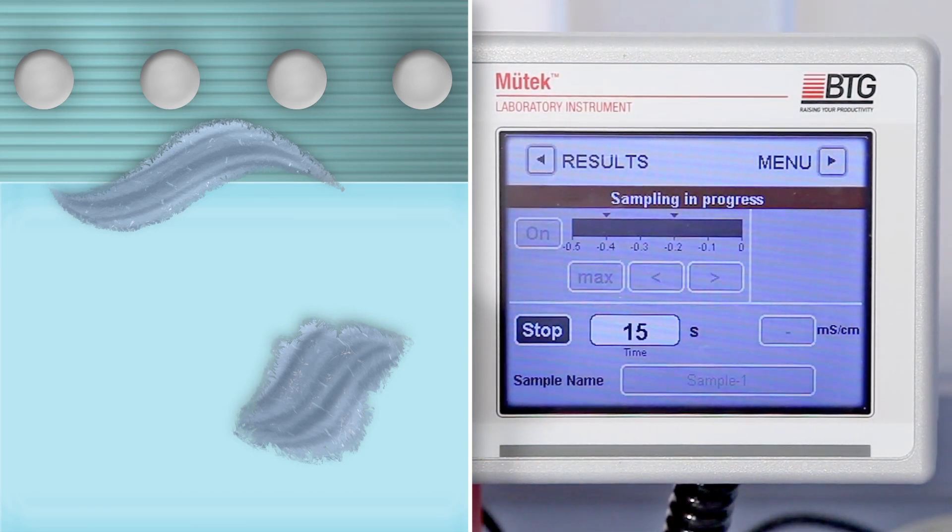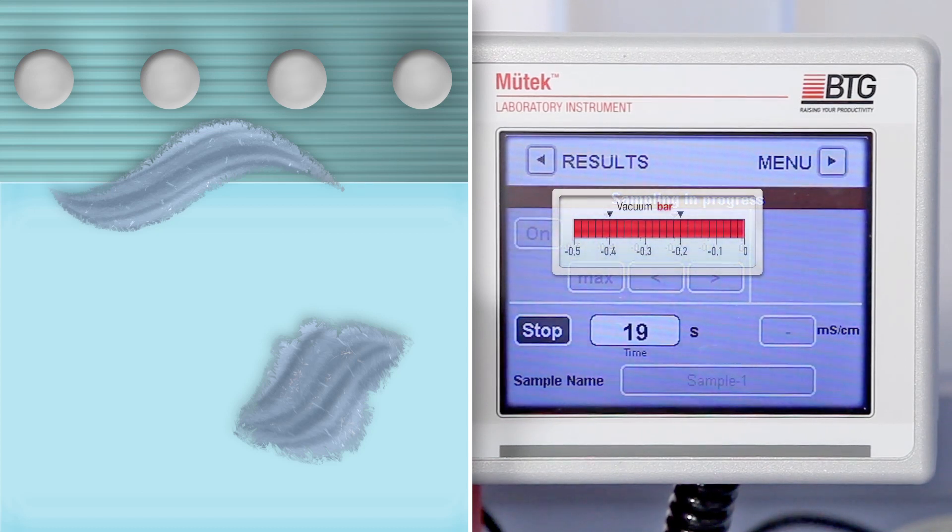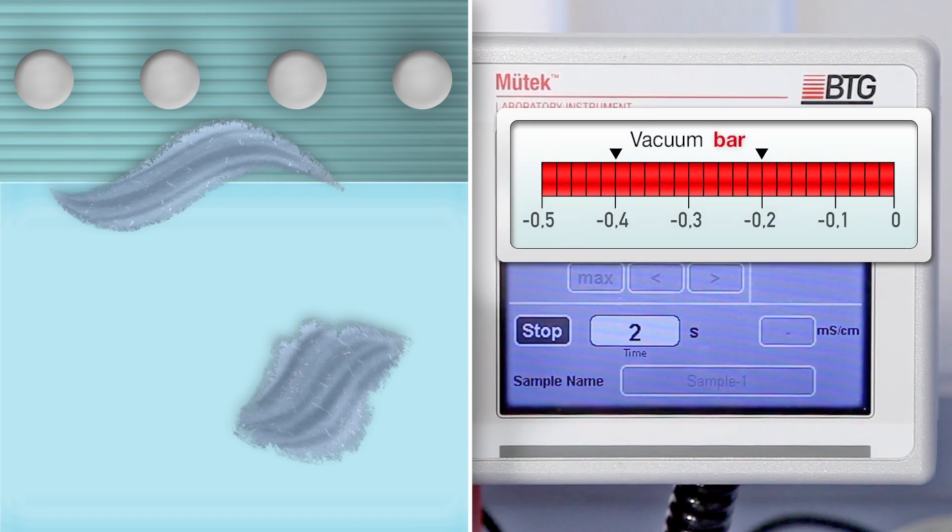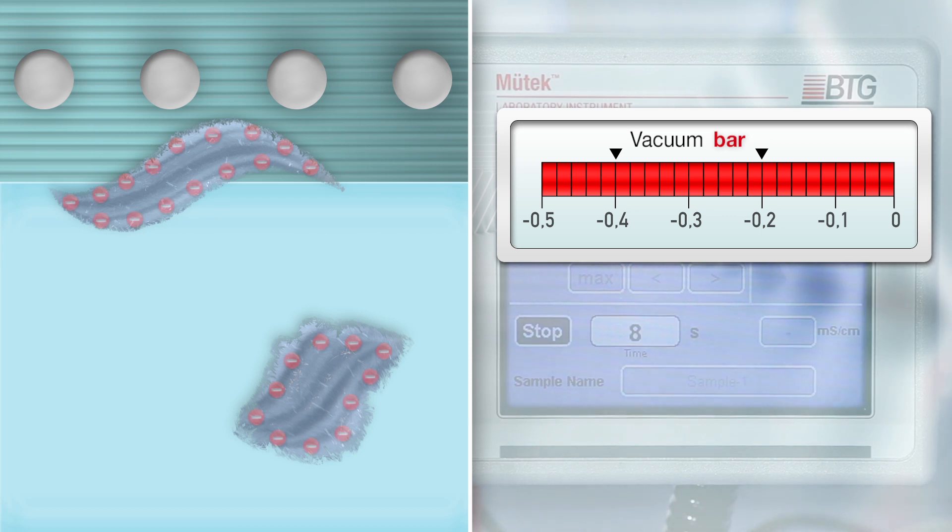The vacuum applied by the instrument is at a maximum during the time of sampling. In our example, the sample contains negatively charged fibers, which carry an anionic surface charge.